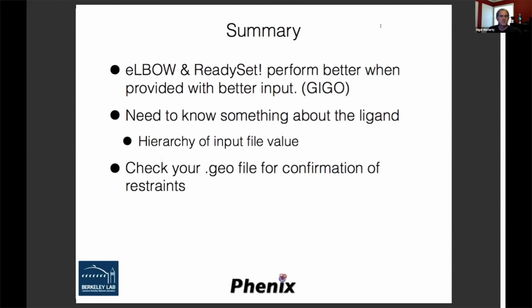You just have to provide one or the other with the other program's restraints library. And I can certainly help you with that. Whichever three-letter code you're talking about, I can expedite the change for you.